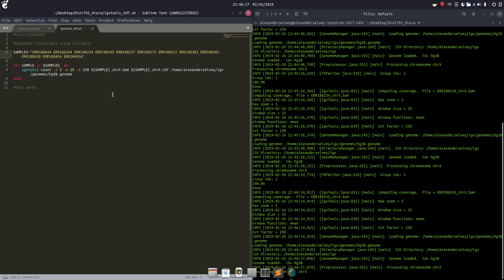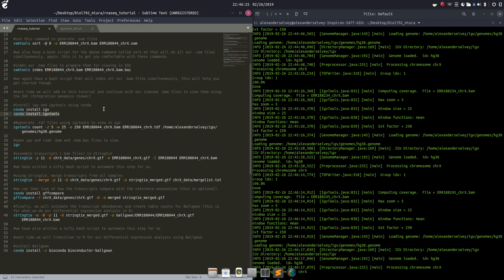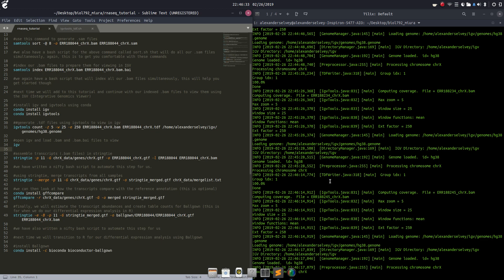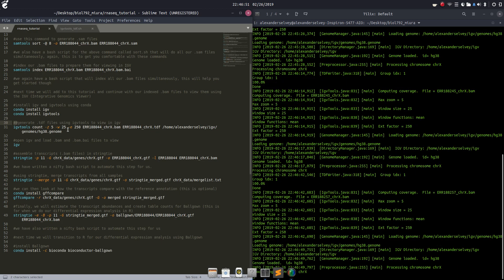I thought I'd make a little update, because last time I just mentioned 'install IGV tools, you can make cool primers from it' without really any explanation. So I double-hashed this section in the script to denote it's an addition that was not in the original part three that I posted — that's why I'm naming this part 3.1. You can create your TDF files if you don't want big BAM files floating around.